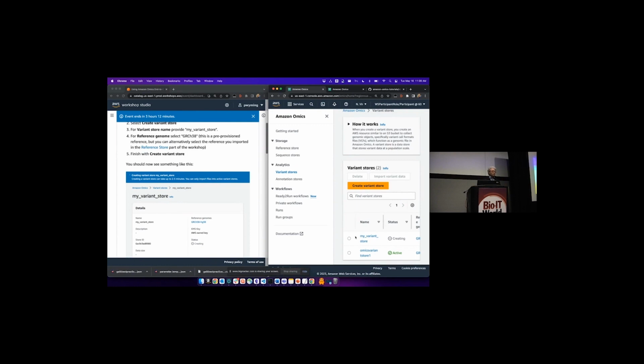Under the hood it's backed by S3, but it's presented to you as a queryable object in Athena. Is there access to the underlying data? No, there isn't, but that's just how Athena works. Under the hood we convert it to a format that's more efficient to query via Athena. So it's effectively Parquet, and it helps with large scale queries.